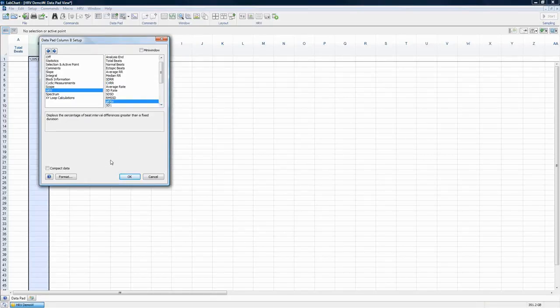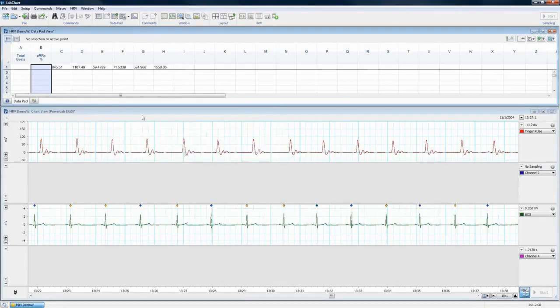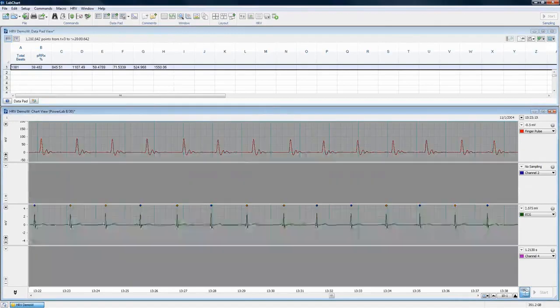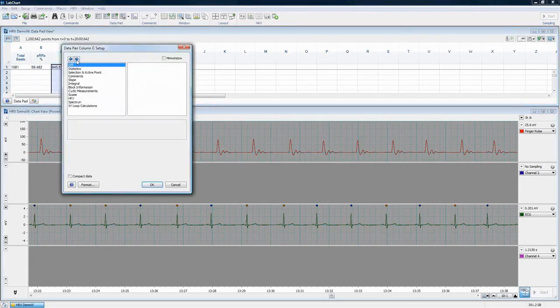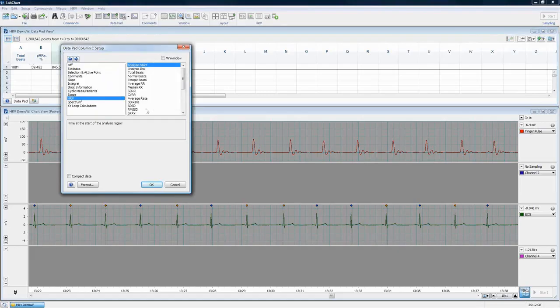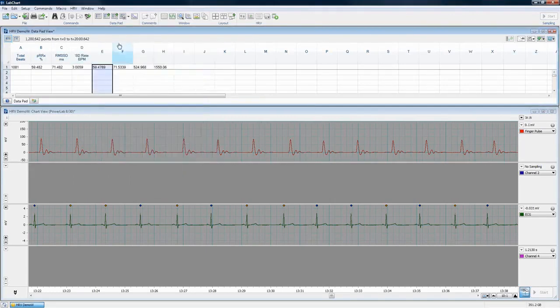What's the percentage of our intervals over a specific time? We can add those here. If I hit Smart Tile, I can see both. We select the whole channel in LabChart. We have them right there. Not sure why the other ones are showing up, but we can just keep going through here in HRV and determining those. And of course, LabChart's going to give you a title.